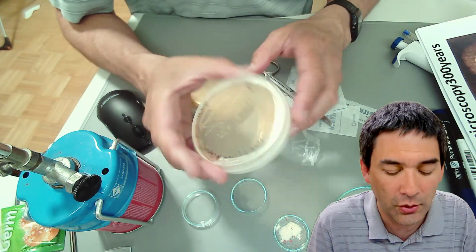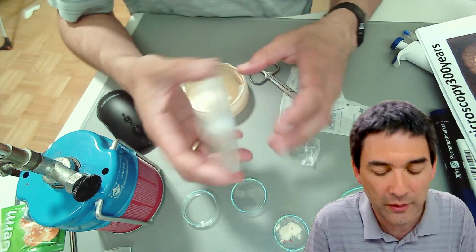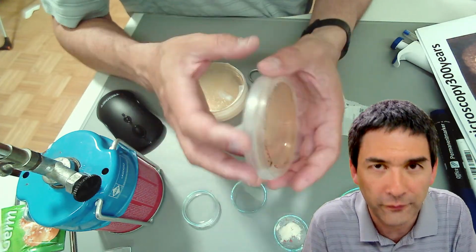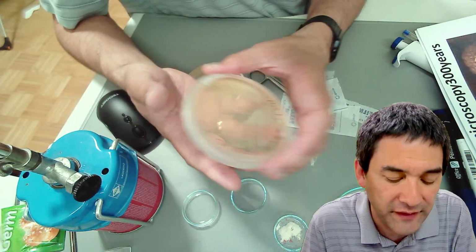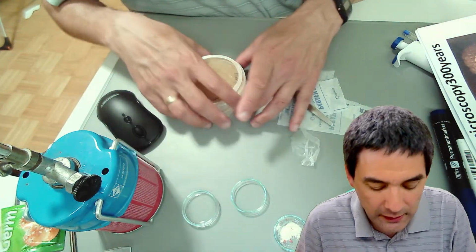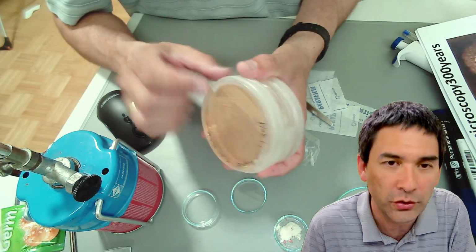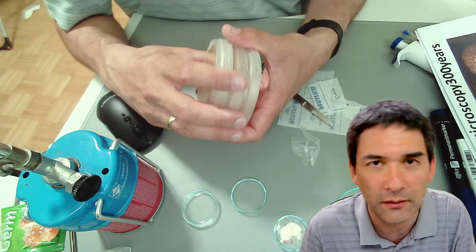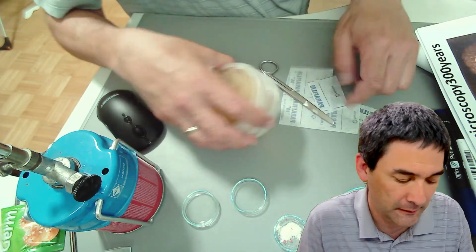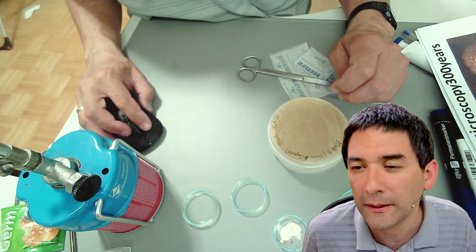And I also use it for safety. So essentially, when it falls down, the lid cannot go off, and contaminants are prevented from actually going in. That's it. While I was at university, we did not use parafilm on the Petri dishes generally, only occasionally when it was necessary, because it does take time to wrap everything.